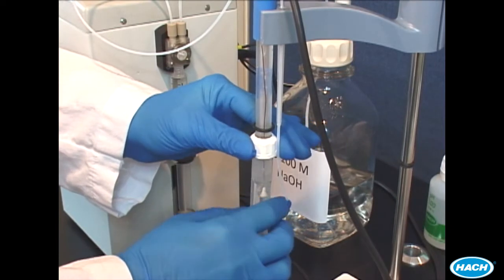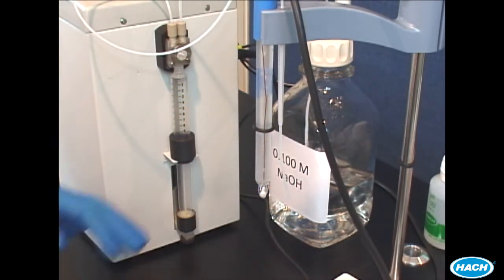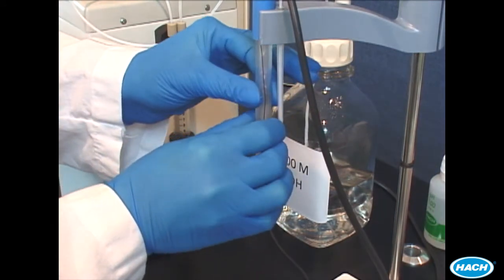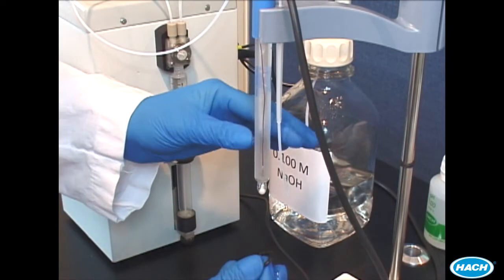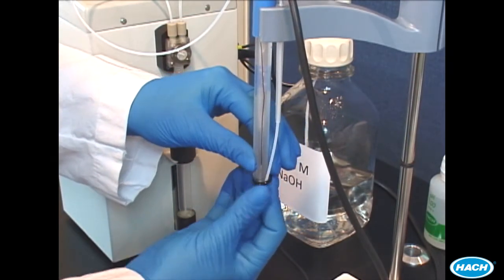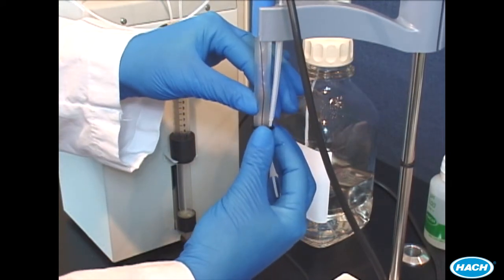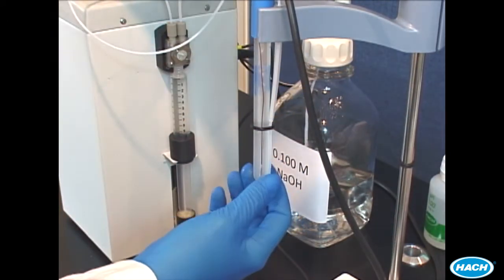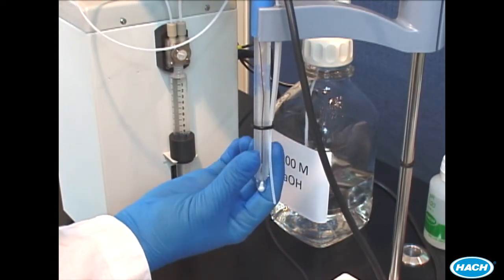Remove the pH electrode storage bottle. Secure the dispensing tube to the electrode with the included O-ring. The end of the dispensing tip should terminate just above the end of the pH electrode.